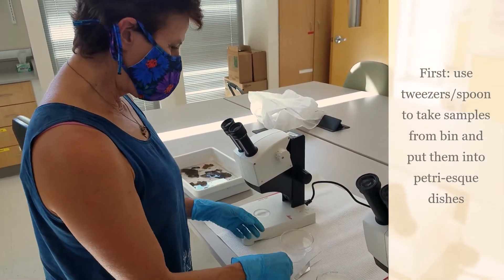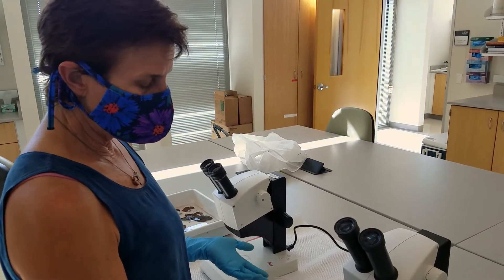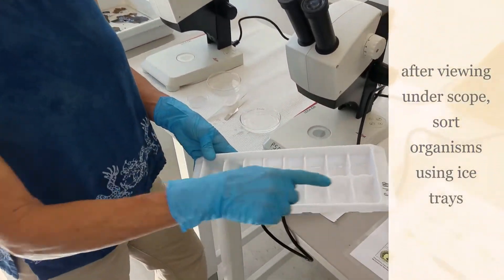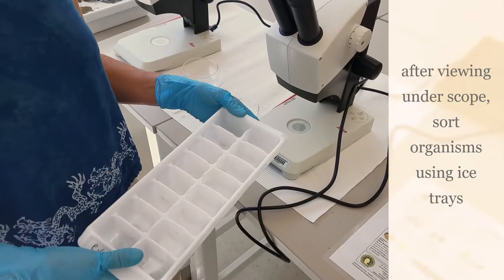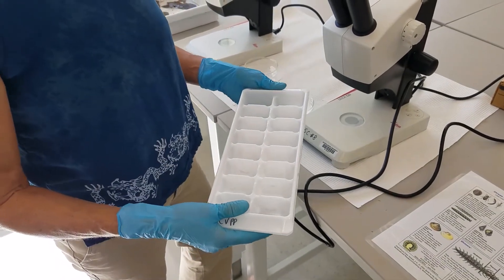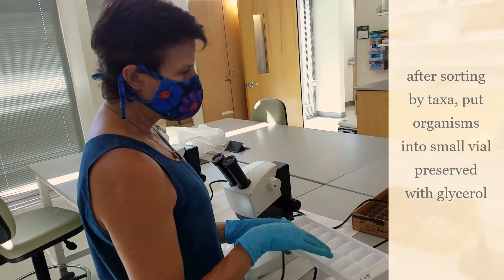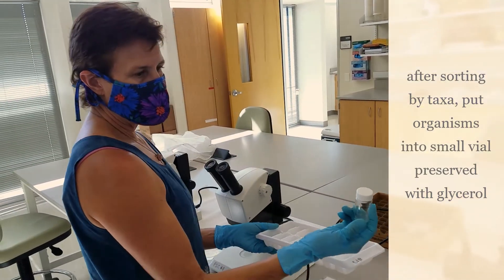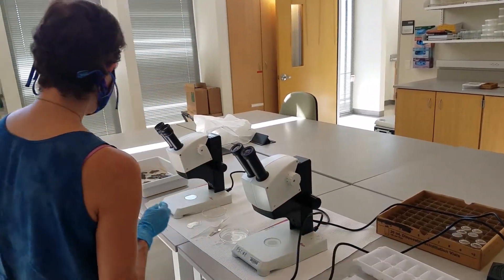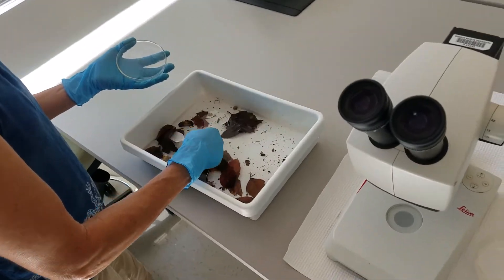We can use a spoon or tweezers to take things out, and then we'll look at the creatures under the dissecting scope and ID them. Normally we sort them into a regular white ice tray — you would put all aquatic earthworms in one, clams in another, et cetera. Then we preserve them in a glycerol solution. After we've sorted them in this tray, we put them into a small vial with glycerol so that we could go back and verify the count.